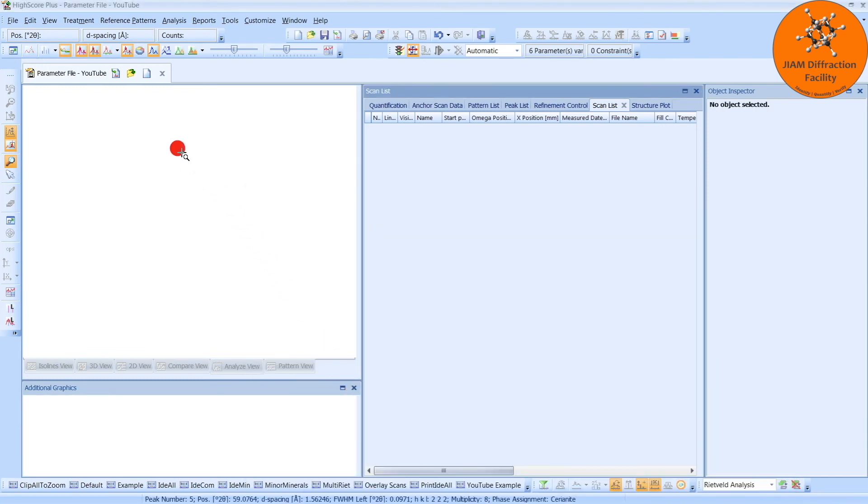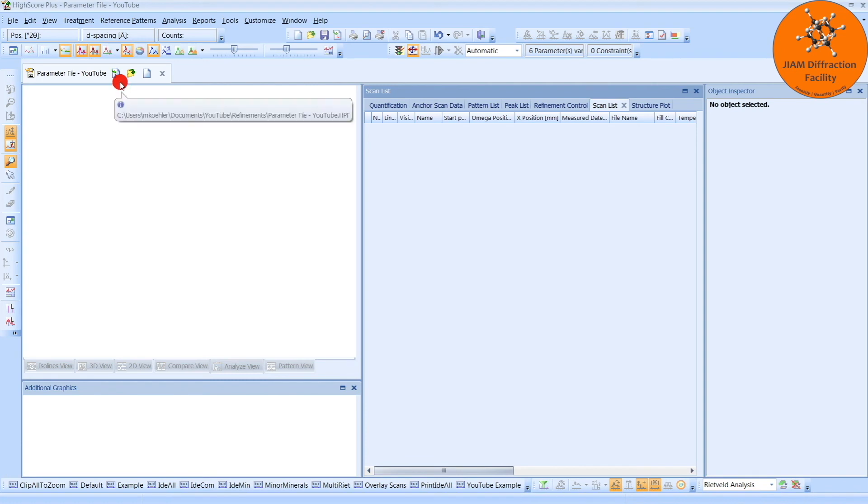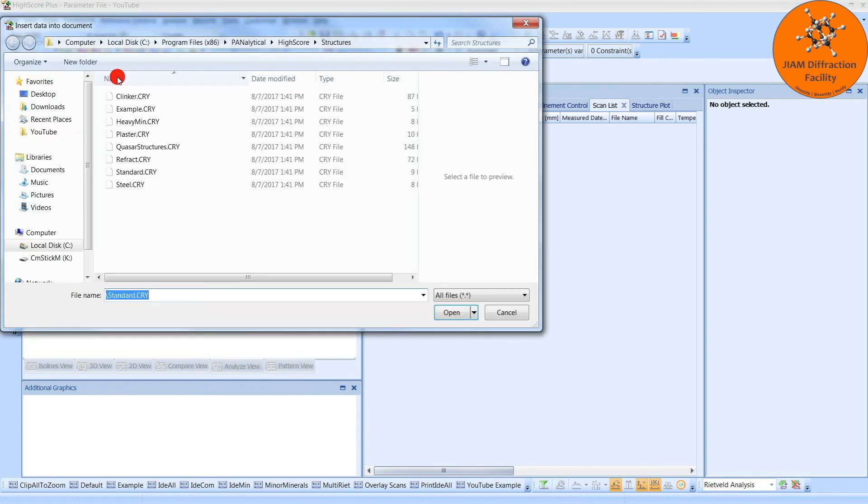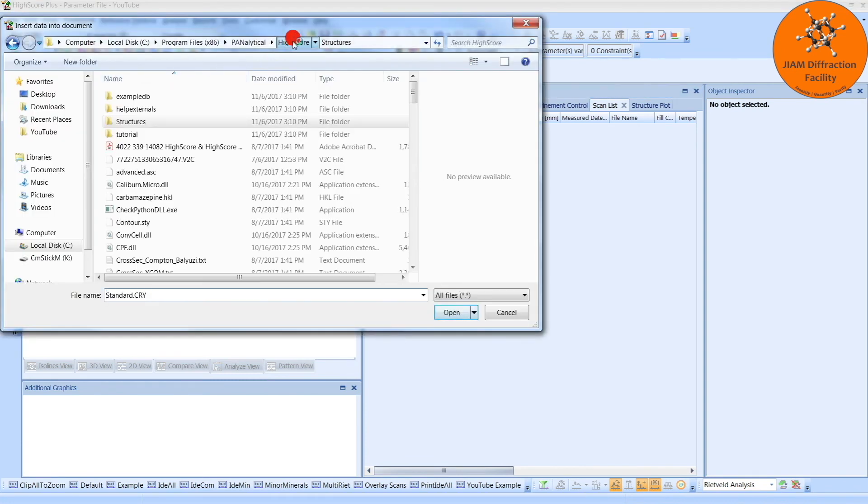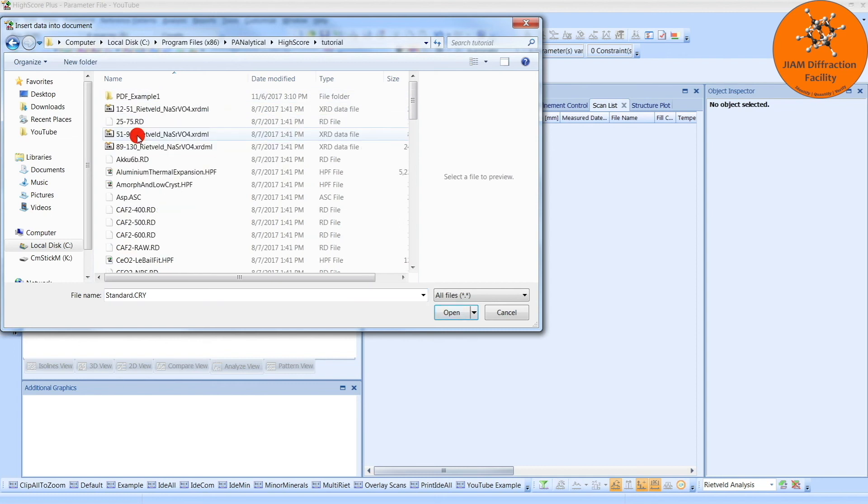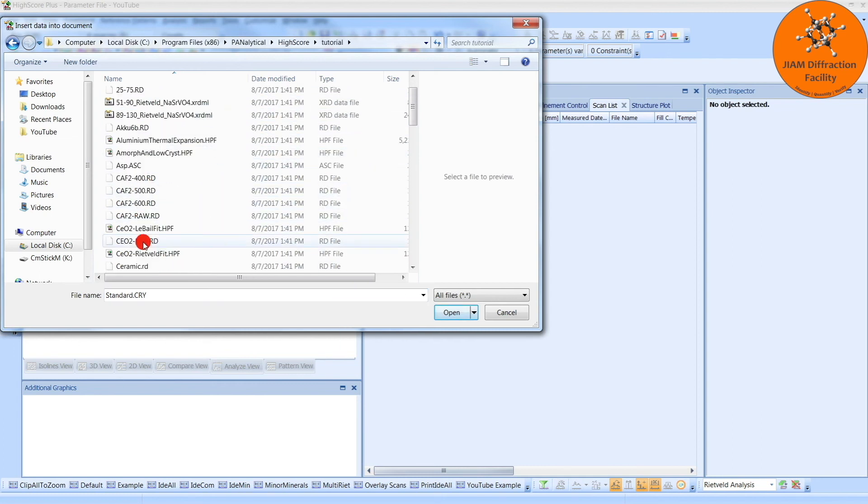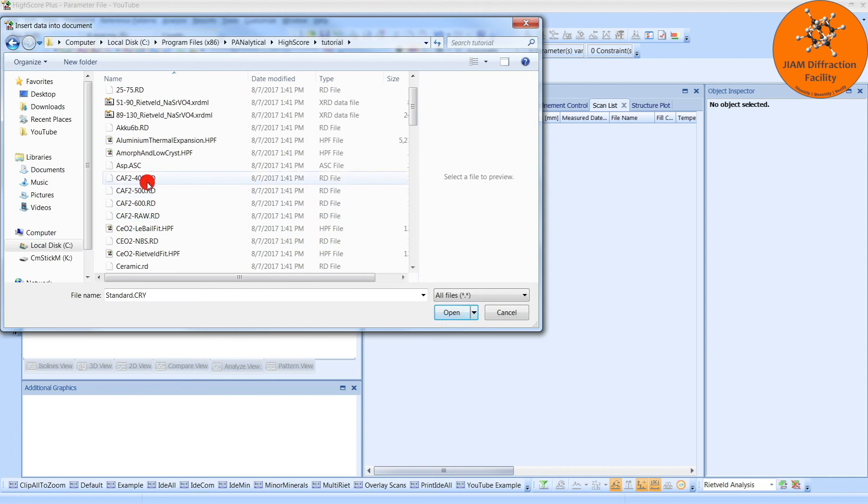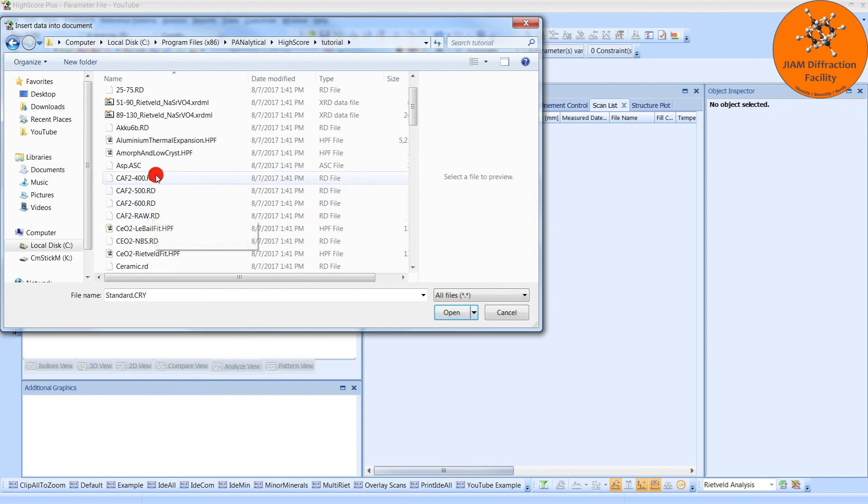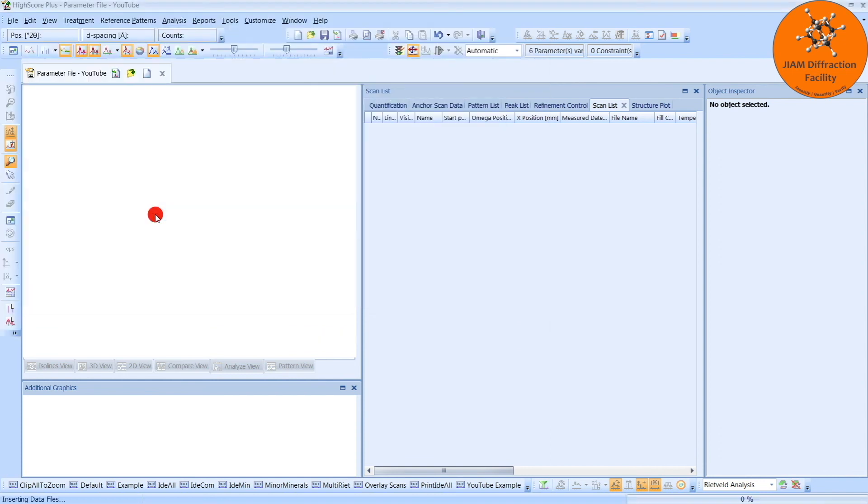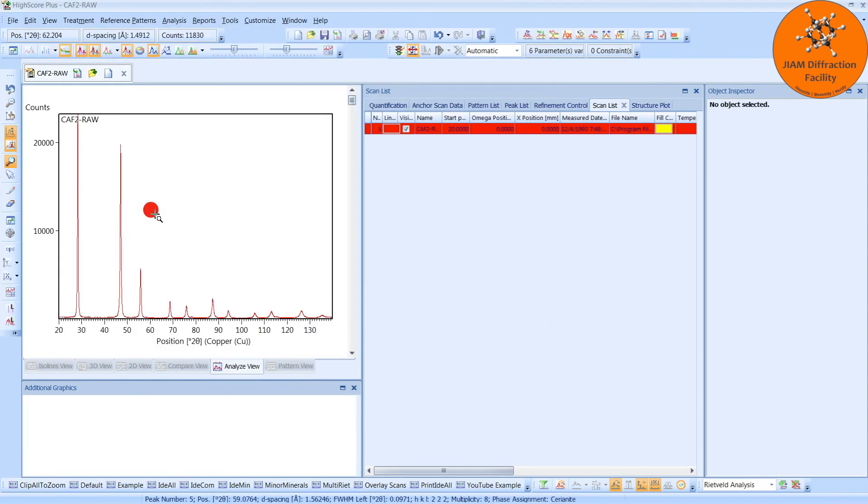I can then come up here, click Insert, go back to HighScore, go back to Tutorial, and now I can click any of these that I like. Again, I will just do the raw for this video, but you can analyze the others. So double click. We now have our new diffraction pattern in there.